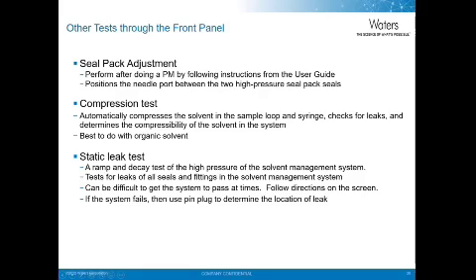It can be difficult to get the system to pass this test at times. Make sure to follow the directions on the screen. If the test fails, then use a pin plug to determine the location of the leak.